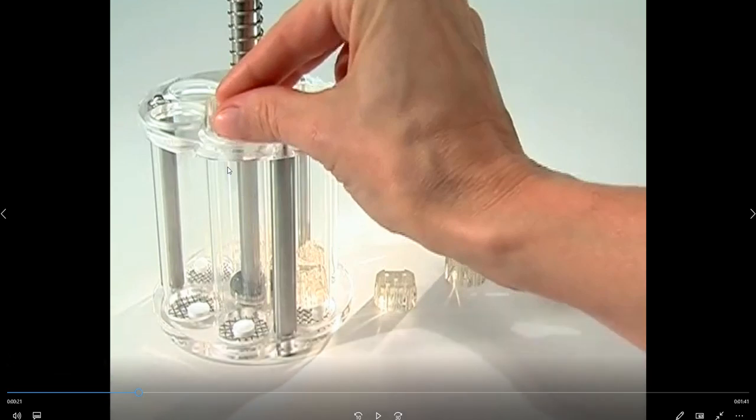So in this case, what do you do? You add these discs. Okay? When do you add them? When specified by the pharmacopoeia, or your product or your tablets always float. And this can happen, for example, in case of capsules. Usually capsules will float.